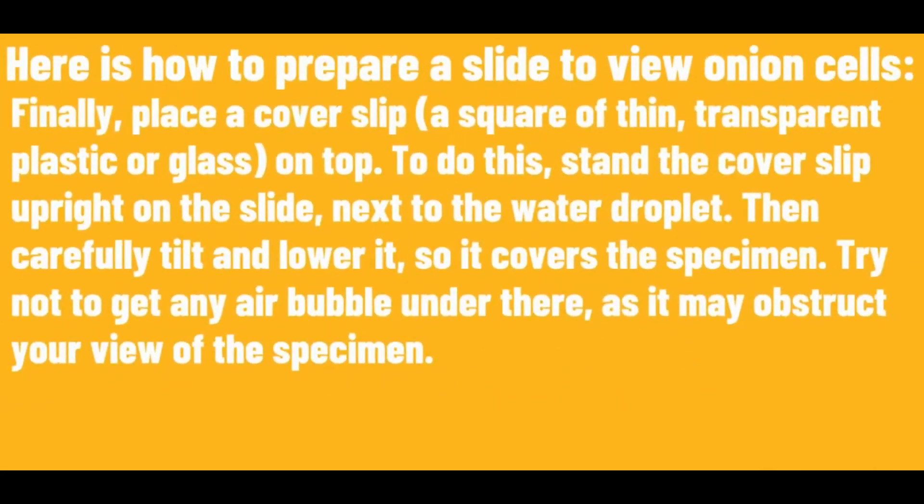Finally, place a coverslip on top. To do this, stand the coverslip upright on the slide next to the water droplet. Then carefully tilt and lower it so it covers the specimen. Try not to get any air bubbles under there, as it may obstruct your view of the specimen.